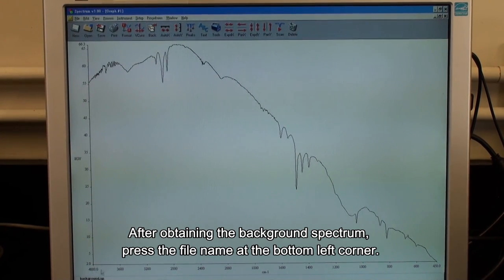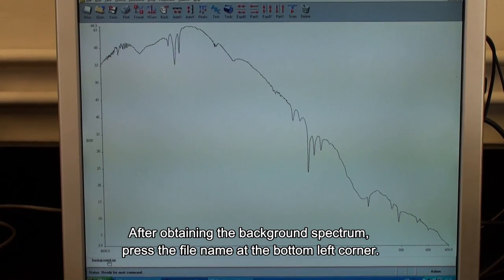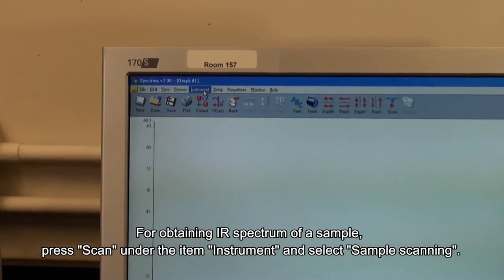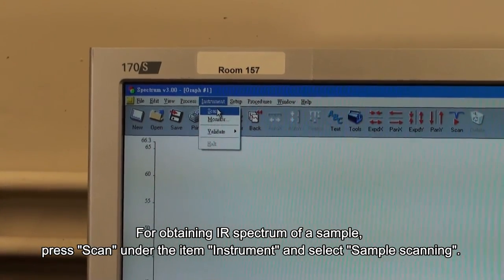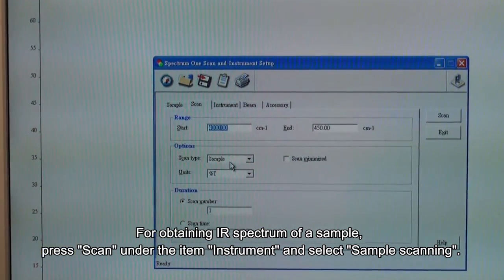After obtaining the background spectrum, press the file name at the bottom left corner. For obtaining IR spectrum of a sample, press scan under the item instrument and select sample scanning. Rename the file name of the spectrum.